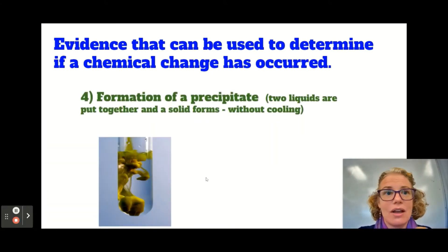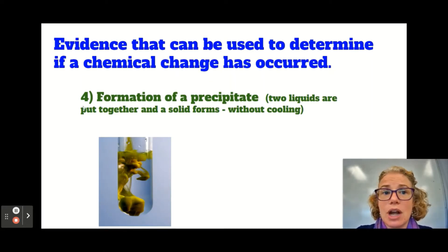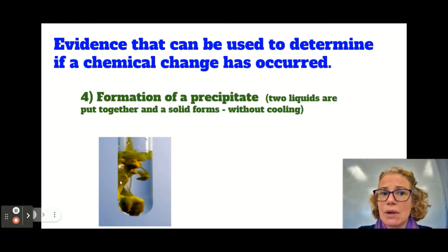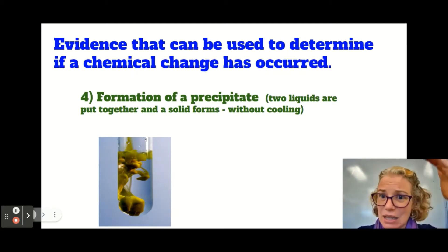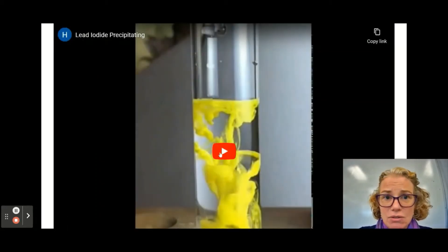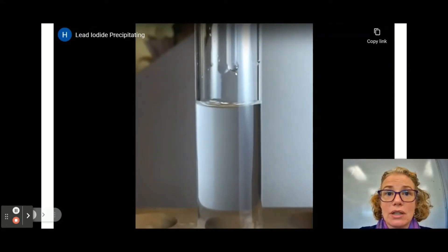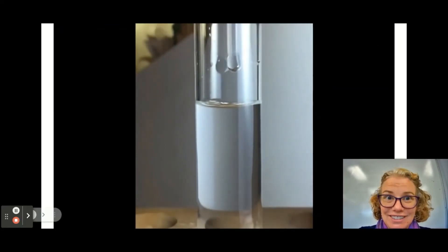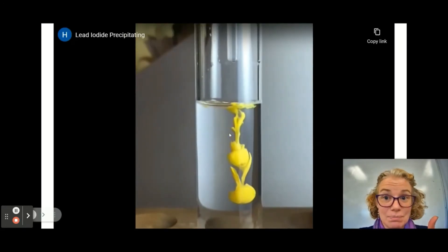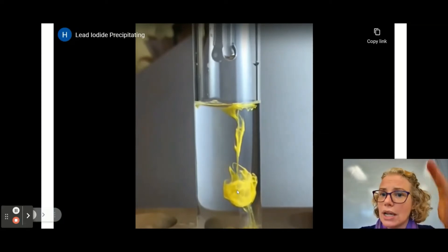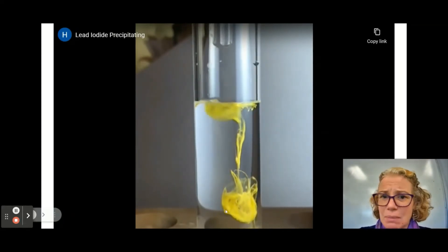The fourth sign is one that is fairly rare — you're probably not going to encounter it often. That is the formation of a precipitate: two liquids are put together and out comes a solid. I didn't cool it down to make a solid. You can tell a solid is forming because it's very opaque, and if you let it sit long enough, the solid would settle at the bottom. Here is a video that shows you this. You'll see there are two clear liquids — one clear liquid and another clear liquid — and we see a color change, which is one piece of evidence. It's also opaque, and given enough time it would condense and settle as a solid at the bottom of the test tube.